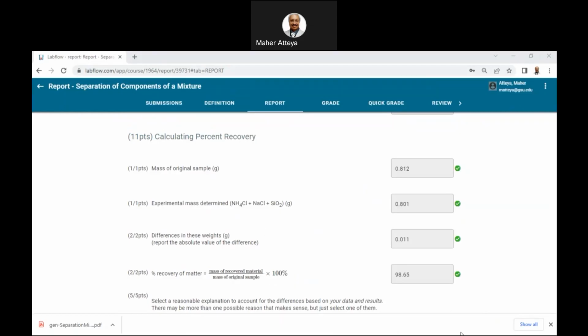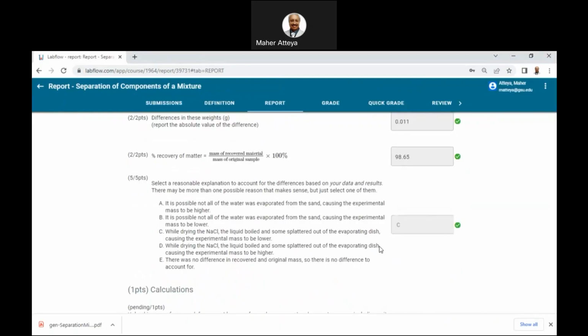Okay. After that will be after the 5 points. Almost there, almost there. The 5 points we have selected. And this one here, copy this. Copy.